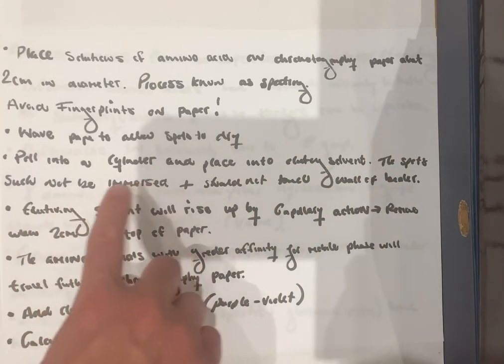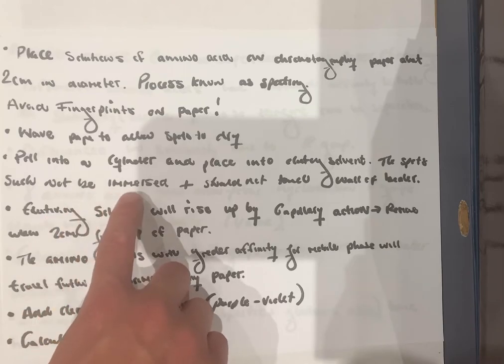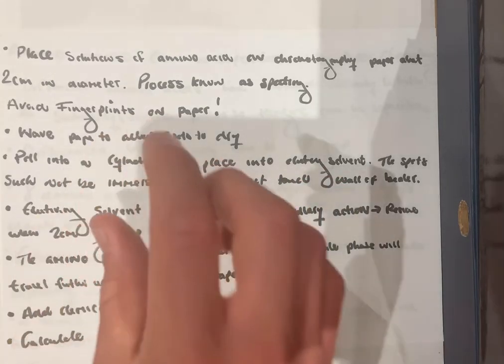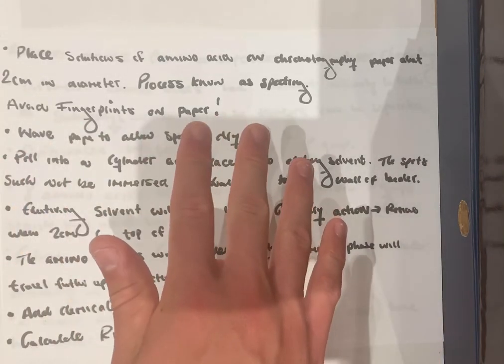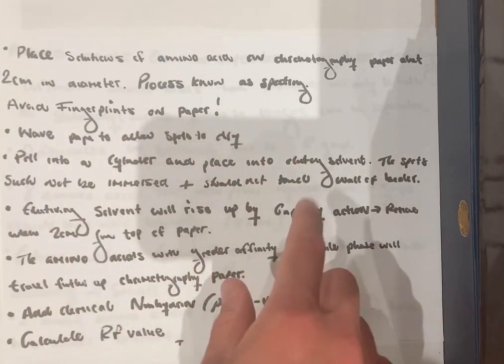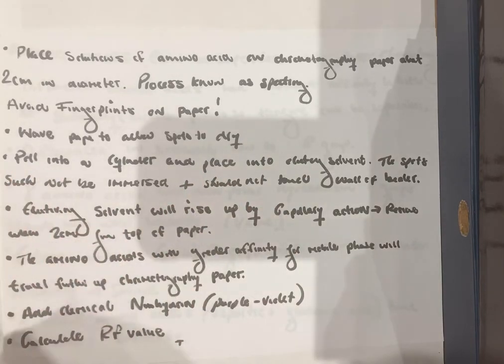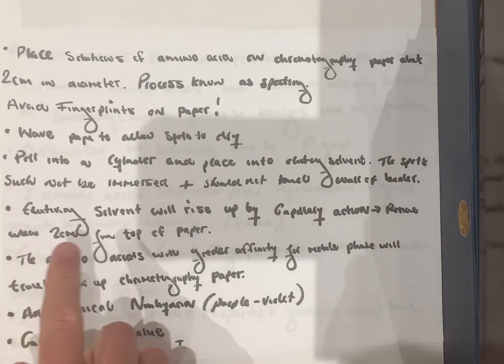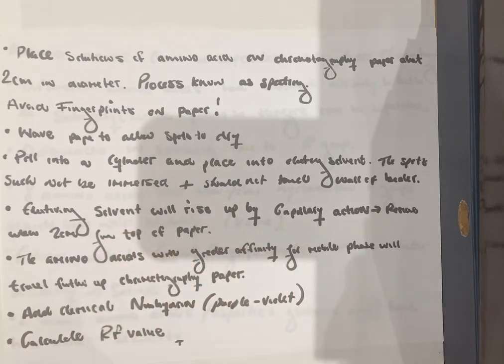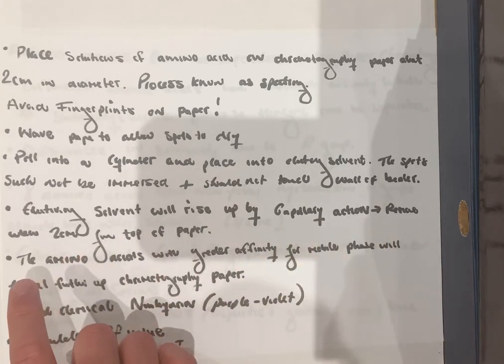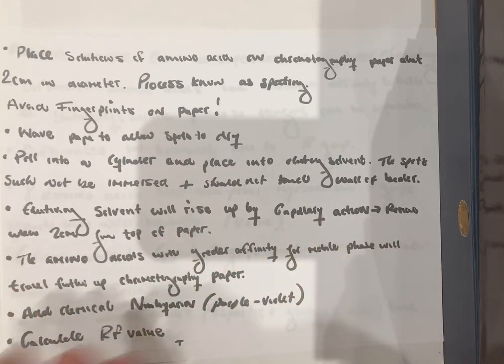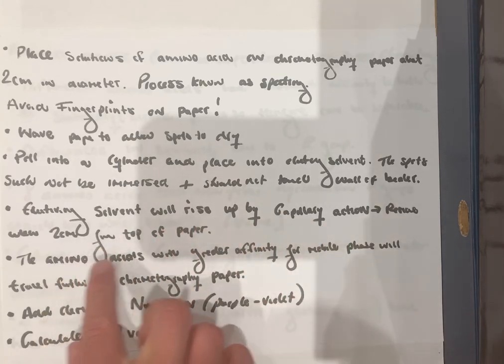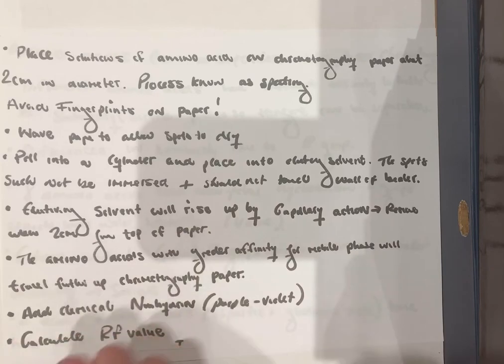Then you have to roll into a cylinder and place into a beaker with an eluting solvent. The paper and the spots should not be immersed and should not touch the walls of the beaker. The spots should be above the line of the eluting solvent. The eluting solvent will rise up the chromatography paper by capillary action. You need to remove the chromatography paper when the eluting solvent gets two centimeters from the top of the paper.